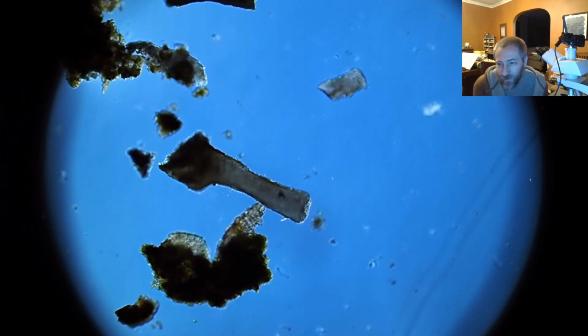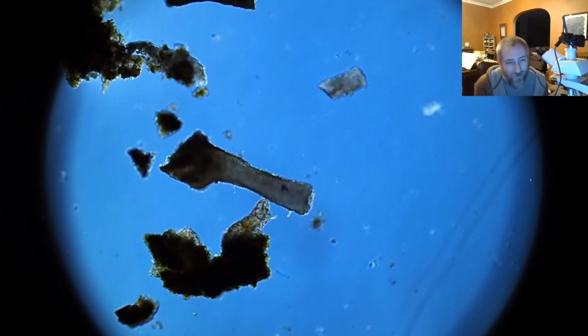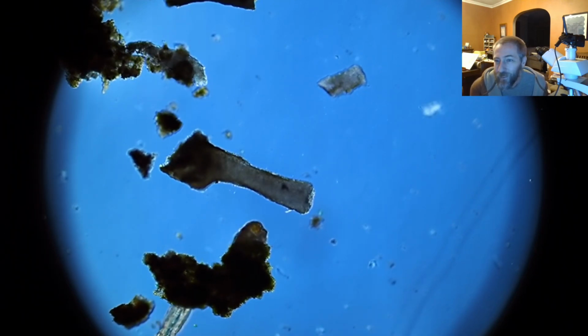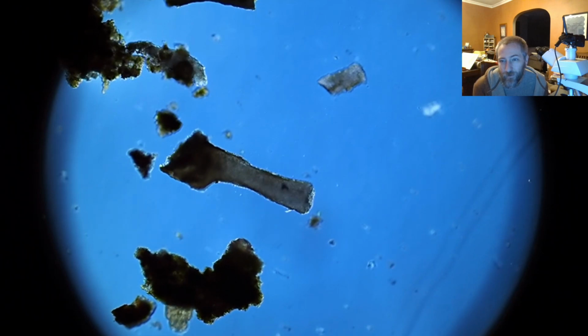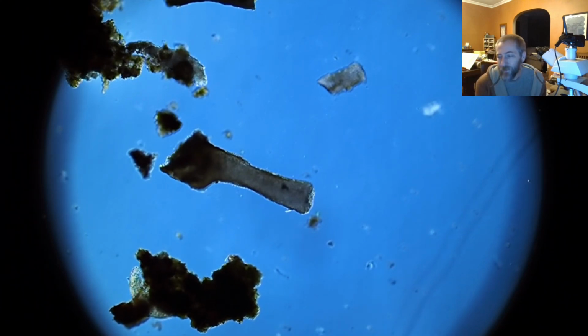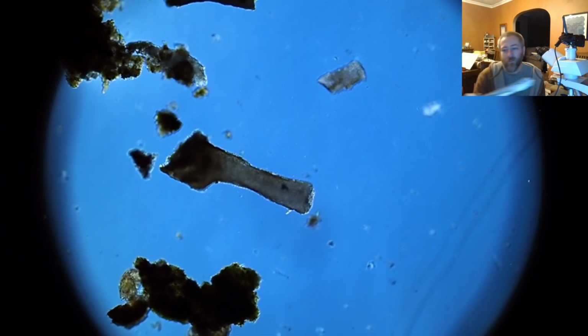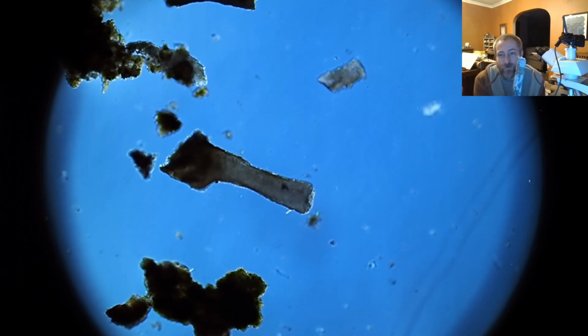Hey, commentator. There's no diatoms in the image that we have here. So the question from Lil Boy is actually, how could you find some? And the answer is you just need sticks. Really.